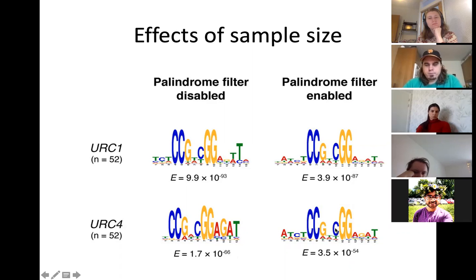I haven't explored this, I don't actually know what the transcription factor is, but if you look at how this motif looks, you have these double C, double G that are the highest conserved, and then you have the spacer. Then on either side, you have these sequences that seem to be less conserved, but still conserved.